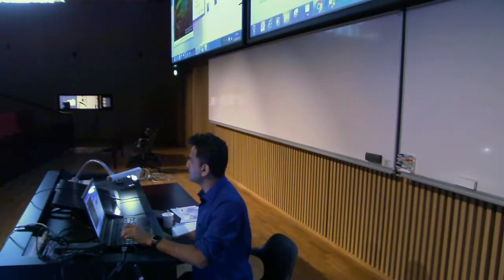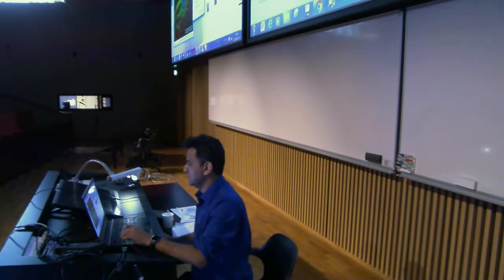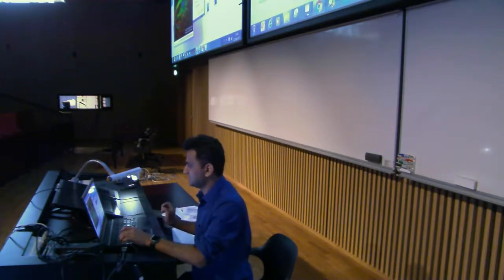Here you can select the location in which you want to put your scale bar. So upper right, you see here there's a scale bar over here, and you choose how much you want to display. Let's say I want to display 50 micrometers. Depending on the height of the pixels, you can change that to 8, for example. That's the width of the scale bar, and the font size is 12, which you can change.